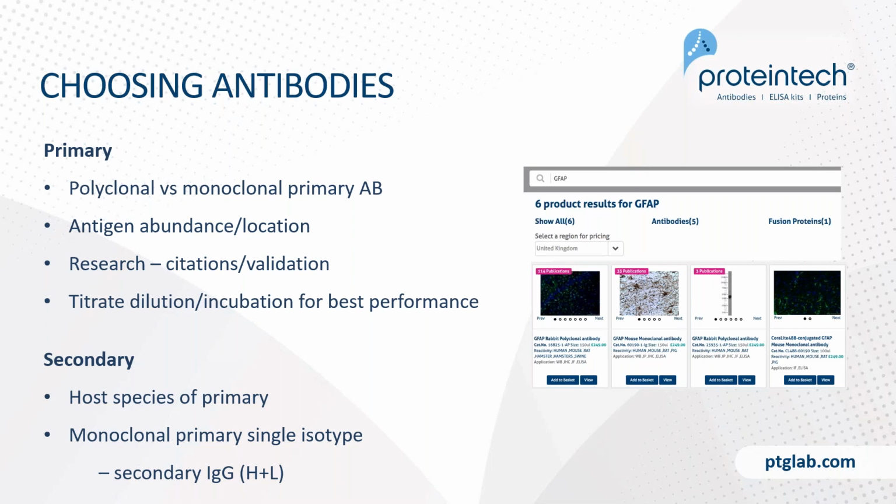Again, when choosing your antibody, it is important that you perform enough research to ensure that your antibody is suitable for what you want. You can ensure that the antibody is cited for the application, possibly with the tissue that you want as well, and the kind of fixative that you're planning on using. The Proteintech website shows you the publications that have used our antibodies, and also will give you product-specific protocols for the application that you require. When trying out a new antibody, we highly recommend performing a titration experiment where you vary the concentration and incubation of your antibody for the best performance, where you want to see the best signal-to-noise ratio.